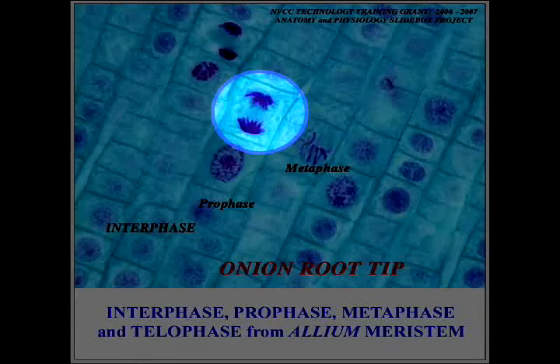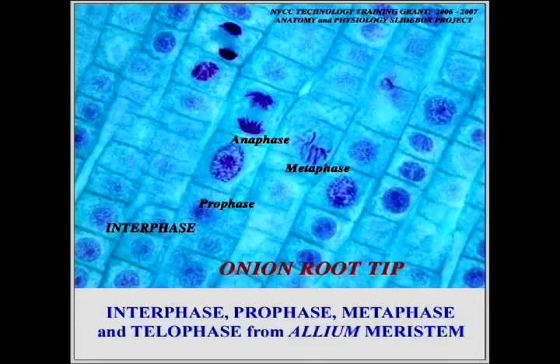So after anaphase, we have the beginning of telophase. And in telophase, the distinctive characteristic of a plant cell, as we said, is the formation not of furrowing, not of invagination. That can't happen in plant cells. The cell wall is just too rigid to allow that to occur. However, you have the formation of what's referred to as a cell plate. And if I do this over here, you might see some cells over here.